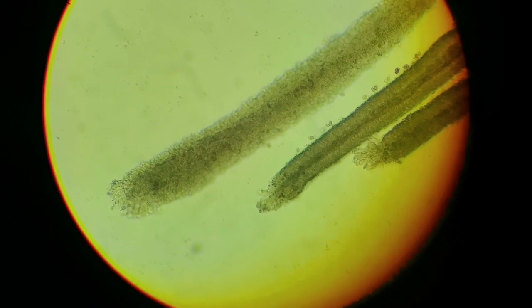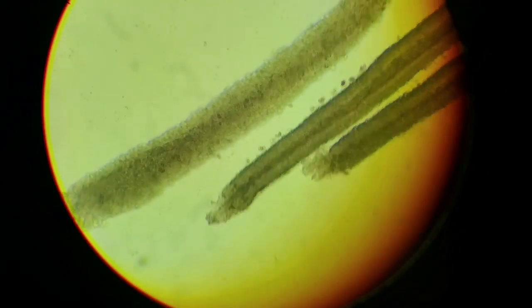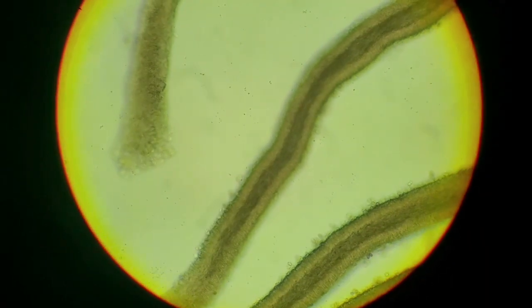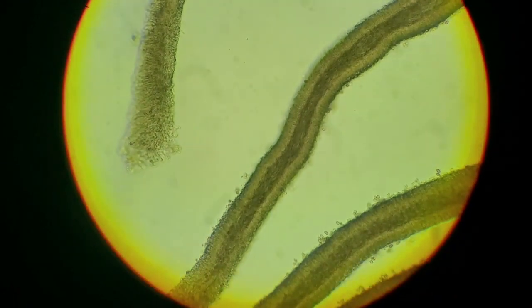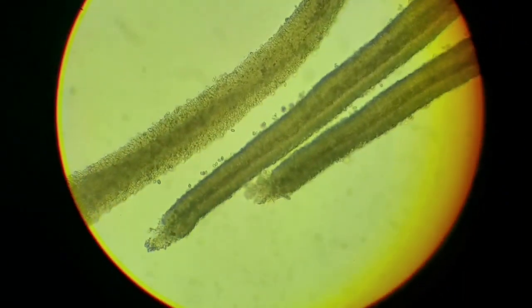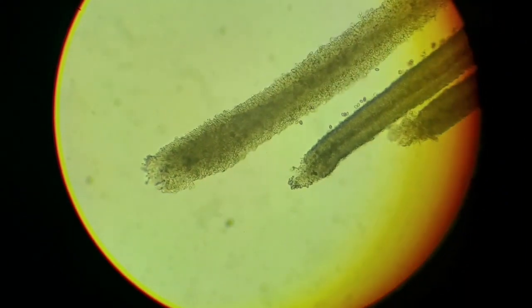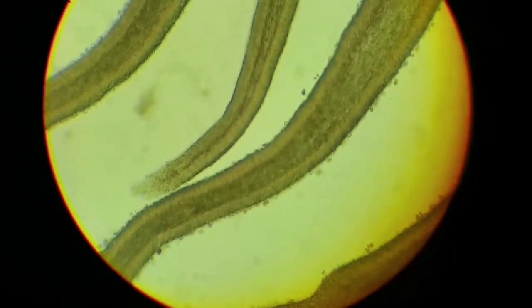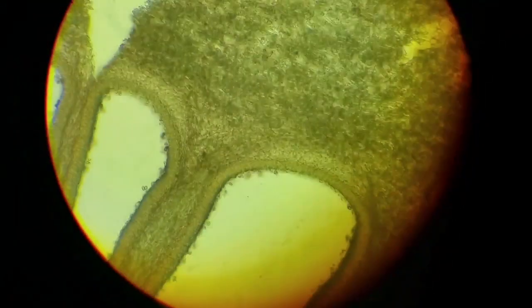Possibly, this is maybe, but as you can see, oh, yep, this one twisted. So this gill that's right in the middle, kind of creating a diagonal line. Right now it's in the appropriate position, but as you start to go towards the edge of the gill, it's already been twisting, and then finally we get here and it's twisted, so we no longer get to see the properties we wanted to see. But maybe in the truncated gills, which is what I think this is, this could be a truncated gill. Oh my lord, I'm going backwards.